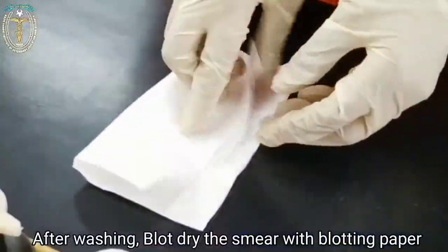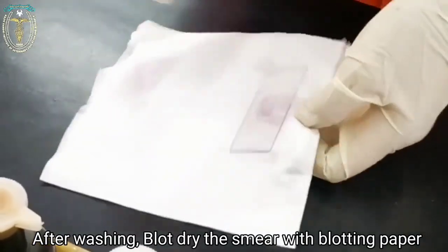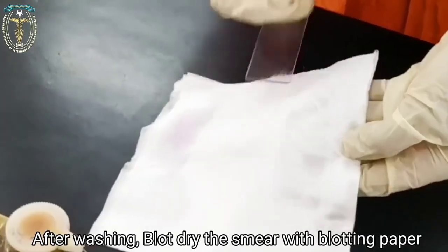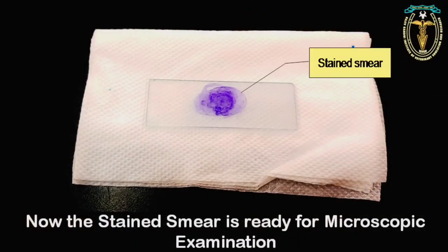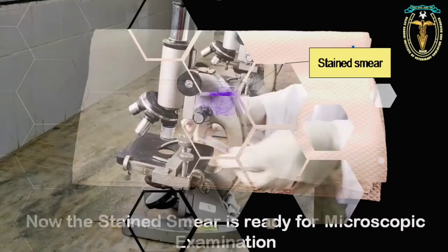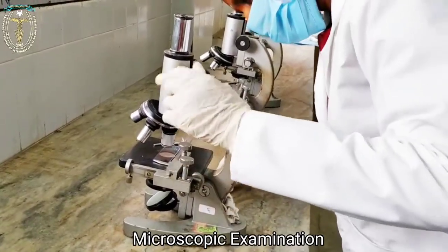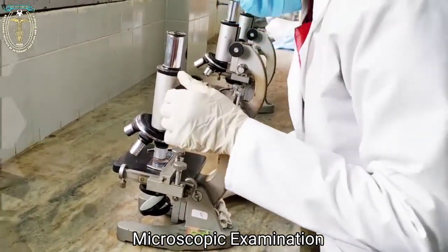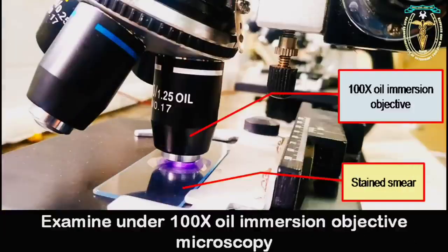After washing, blot dry the smear using the blotting paper. Now, the stained smear is ready for the microscopic examination. Place the stained slide over the stage. Examine the slide under 100x oil immersion objective.